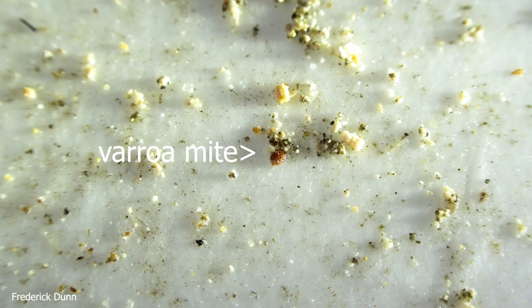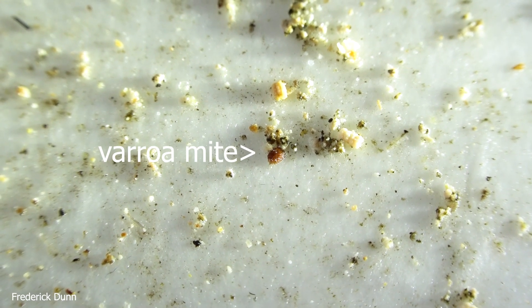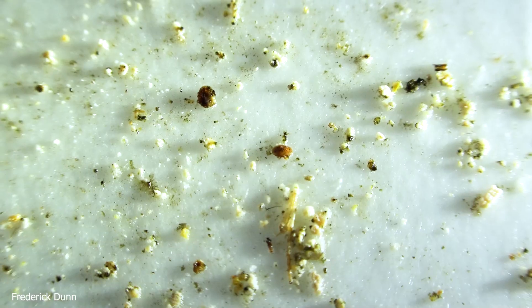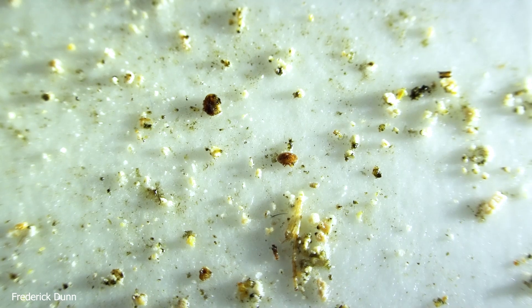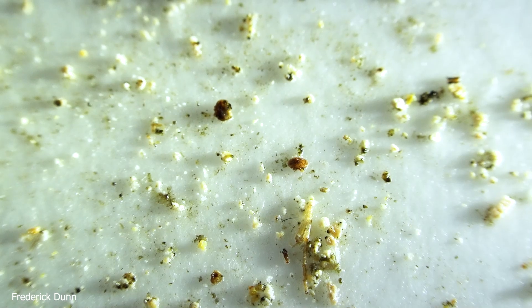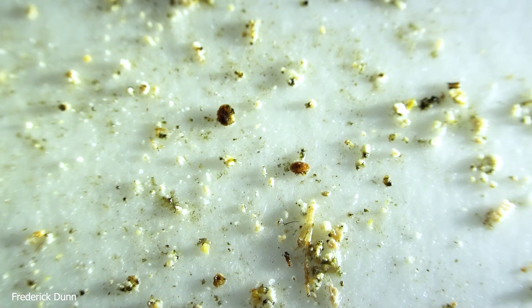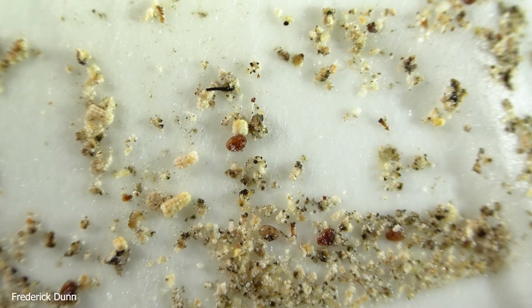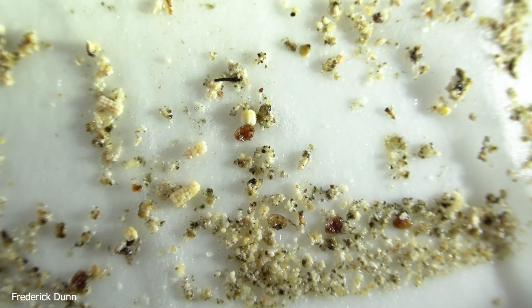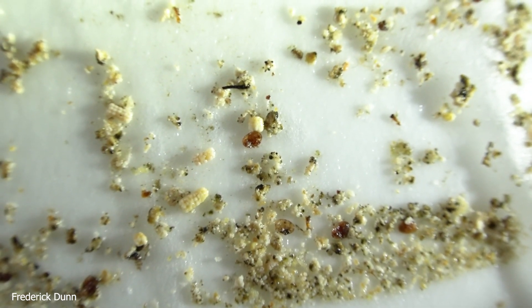Also, this does not count as a varroa mite count method — it just proves that there were mites in the hive. It does not prove that they're at a level that would require treatment. That kind of mite count comes from live bees. This is just collecting the detritus that happens at the bottom of the hive over a period of several months. By the way, that's a varroa destructor mite in the middle; a little high and to the left, that is not a varroa destructor mite. How many mites do you see in this picture?